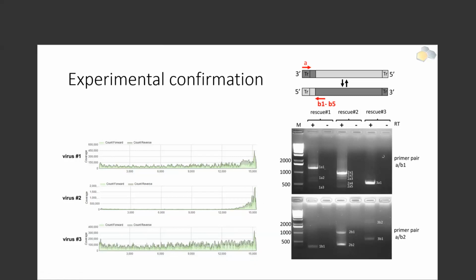and these were the data sets that we looked into to find these DVGs. And our collaborators, Dr. Sauder and Dr. Postman, looked into PCR approaches where they created different sets of primers that capture these DVGs practically, and they were able to observe them.